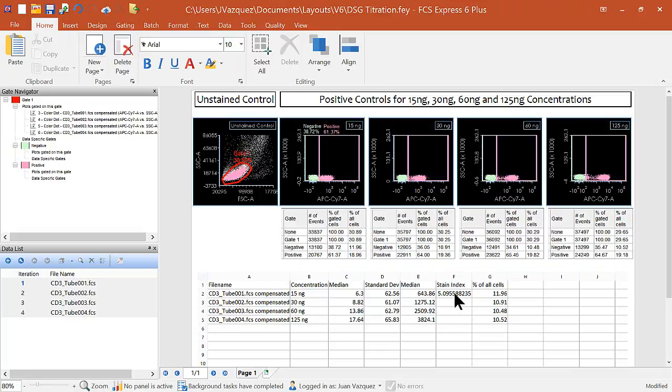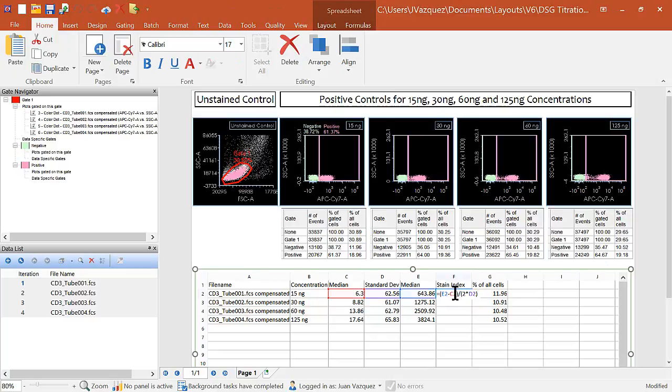What we can also do is we can do a lot of the same formula creations that you would do, where we can just specify what kind of cells, make up a formula, and do whatever math we need to do for that cell. But what we can also do is simply copy and paste. So if I just want to Control C and Control V, I can simply copy and paste, and you'll see that the variables for that formula automatically update for the cells in that row.